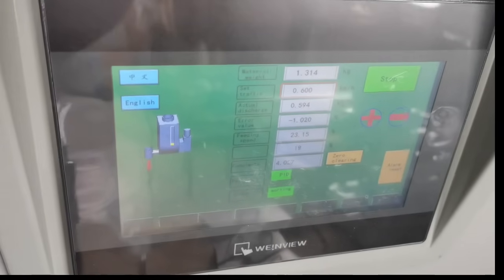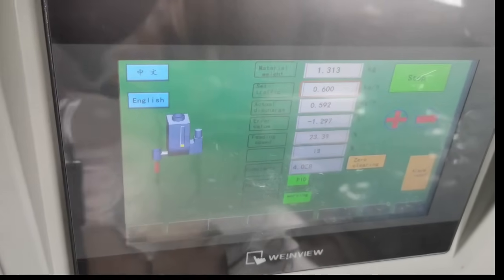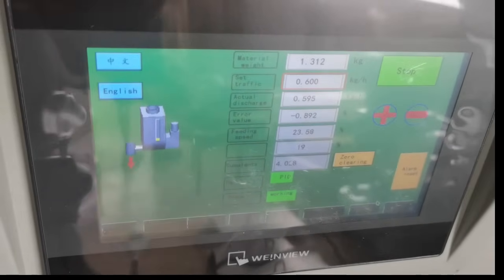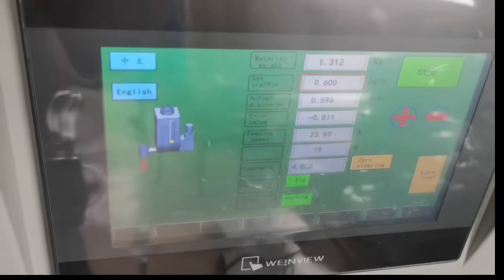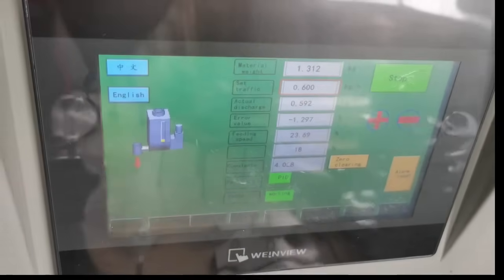The twin screw feeder has very good accuracy, has high precision.